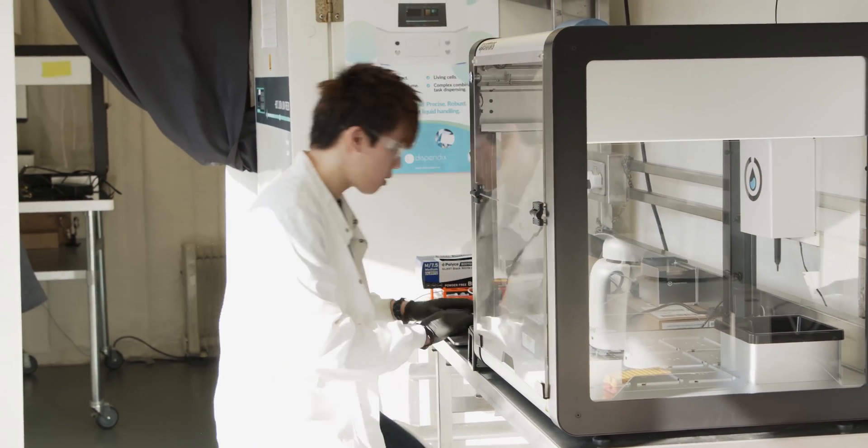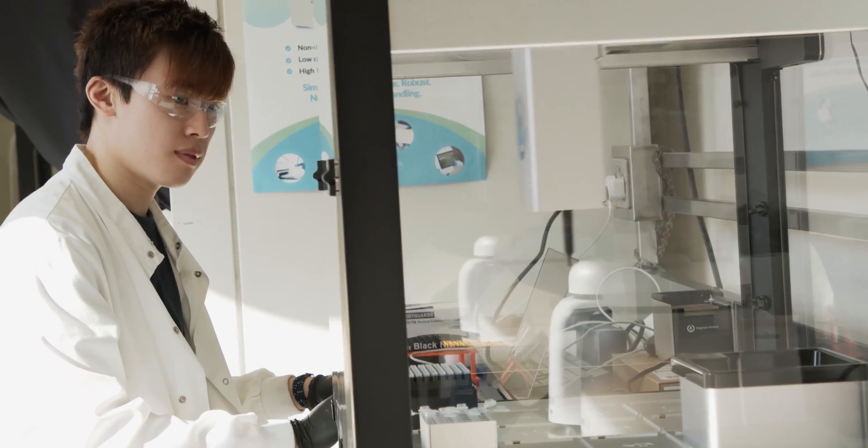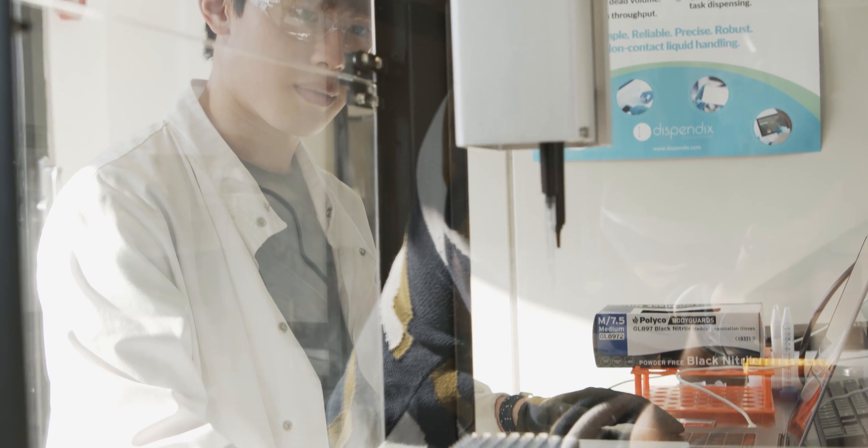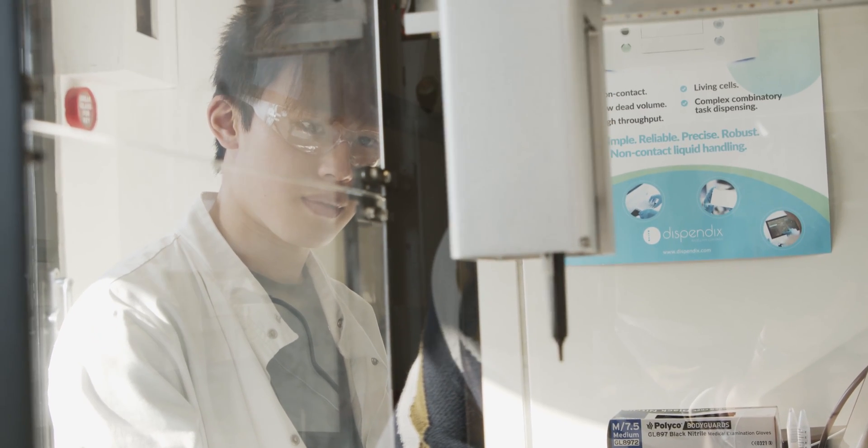Once we have known what is the testing procedures of this COVID-19, then we try to write the protocols to control the machines and process it in the automatic methods.